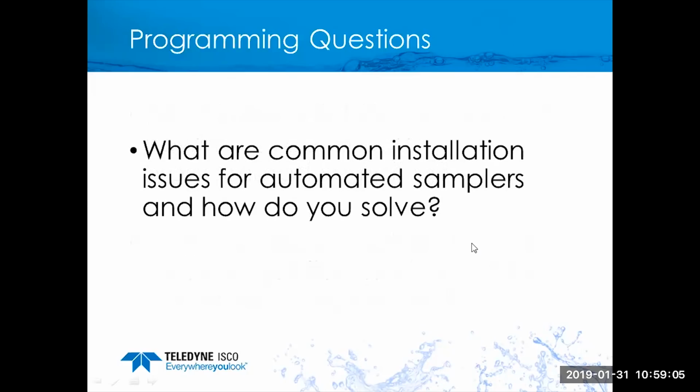The last question I'm going to answer for our time here today: what are common installation issues for automated samplers, and how do you solve them? These questions and answers are just based upon my experience over the last 35 years.